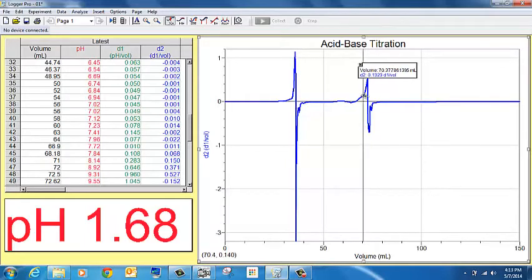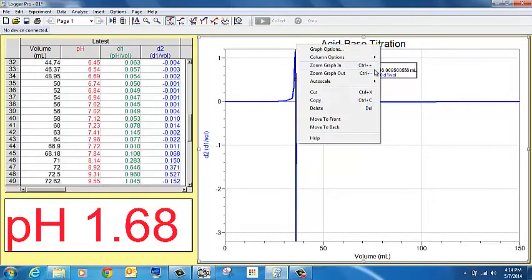And we can do it over here as well. If you're really good, you can leave that line there. It's hard to do. You kind of move the pointer off the screen like this. Let me move it back on the screen and get close. And we'll slide the pointer off. Here we go. And I can move the little circle back manually by pressing my left arrow and get it to where I want it. Now I can right-click and save it right there. And that'll actually save those values showing on the screen.